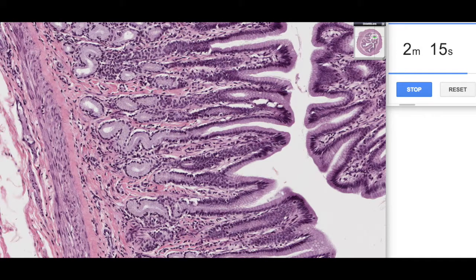And the glands which are present, and this is a glorious one here. Look how this is sort of twisting away. So this is evidence of a simple coiled tubular gland, and it's quite rare to actually get the gland in its entirety like this. So I thought this is really rather quite special.